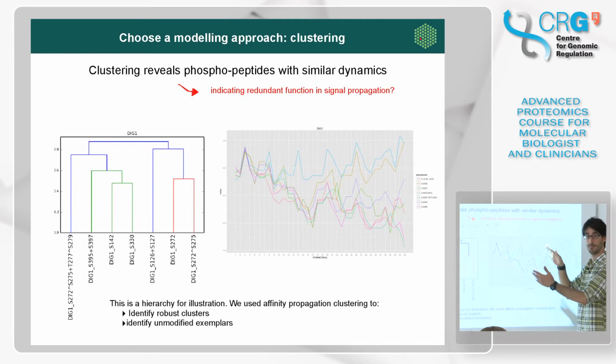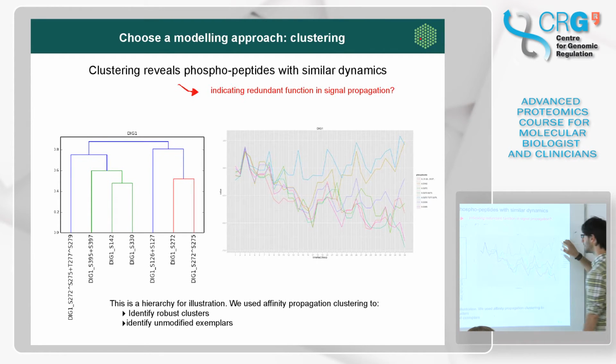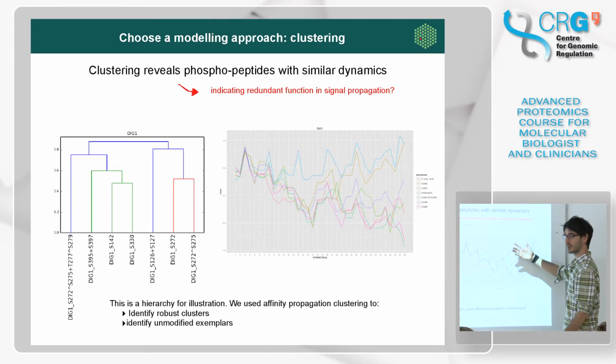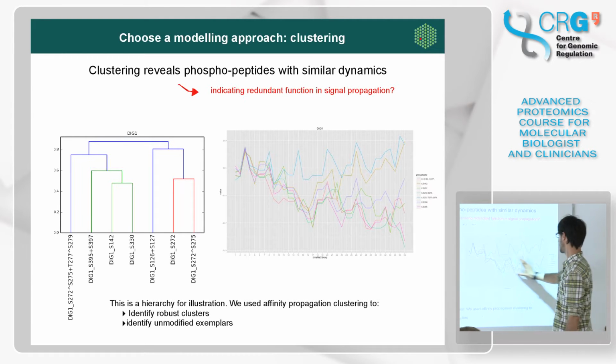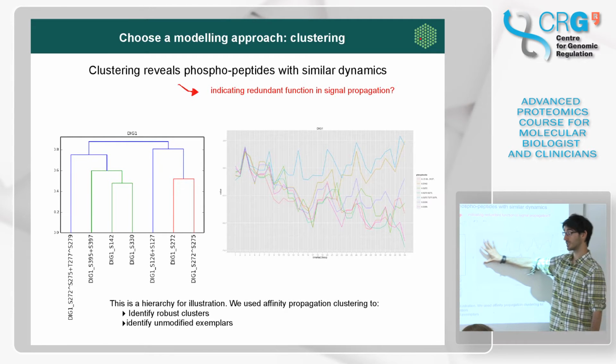So I'm using the same representation as in the box plots, if you know what I mean. So this is 6 experiments, and so on. So this is concatenated. And then what you see here is that each one of the 7 phosphopeptides, you can consider them similar, if you will, in that bunch here and in that bunch here. As you can see, this is actually very crude in this representation, because even though these 2 peptides act similarly, like they go high here, they go low, and so on, so they are similar, they are not similar at all in all of these experiments.